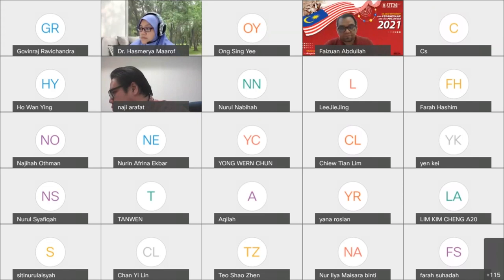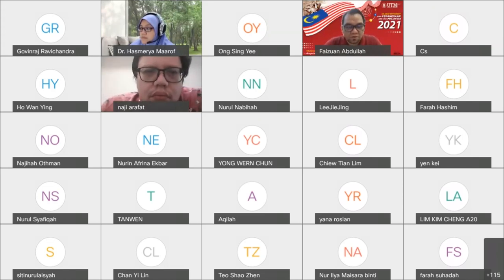I believe that some or most of you have limited skill in using this apparatus and handling the chemicals. For that, we have provided a basic skill video on handling the pipette, how to do the titration, and how to use the analytical balance. It will also be provided in the e-learning.